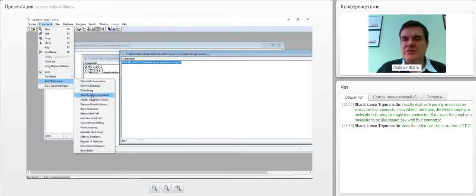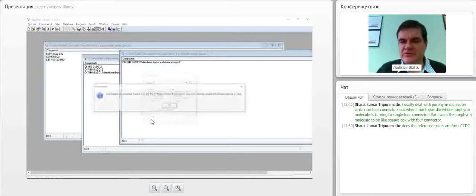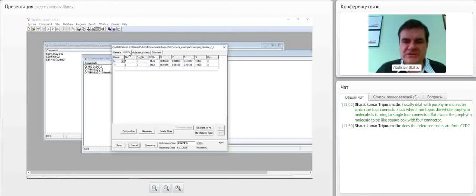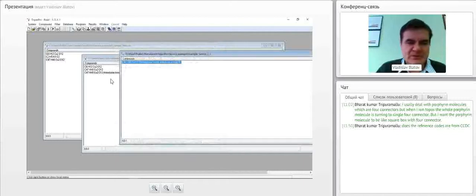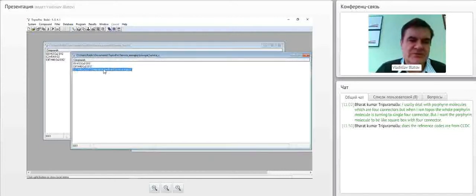Again, we have 3,4 coordinated net, as in the first example, you remember. But if this is the same topology or not, we don't know, and we should determine it. Let's do it one by one. First, I consider this database with the first simplified variant. Here we have again, I remind you, the structure simplified in the standard way.